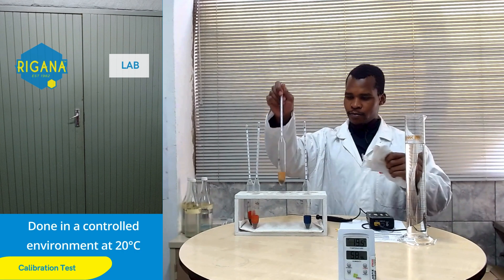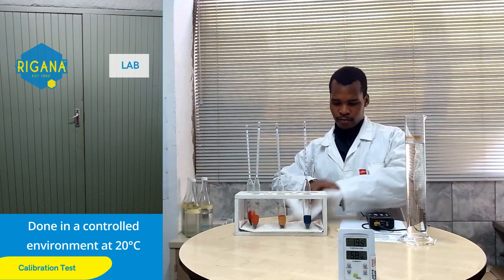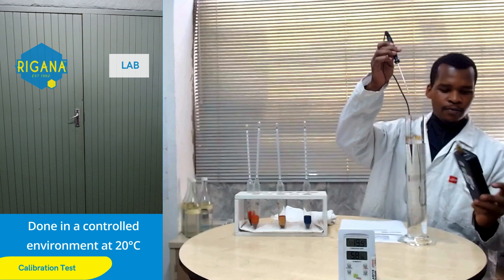Regana has its own calibration laboratory. Calibrations are always done in a controlled environment of 20 degrees Celsius.